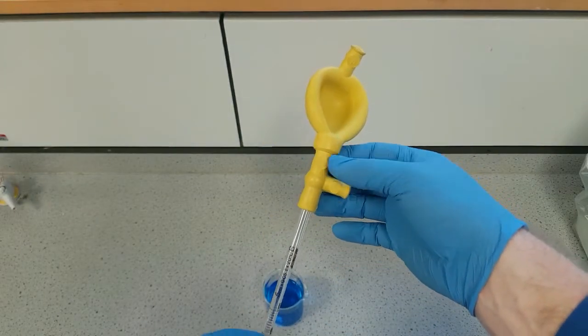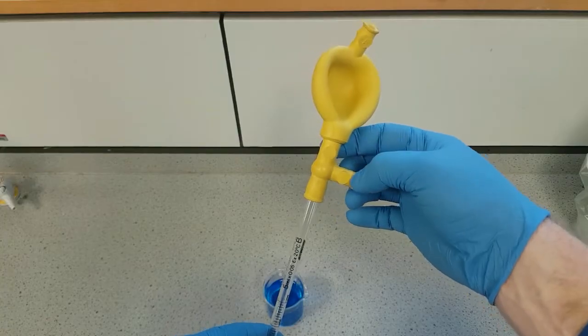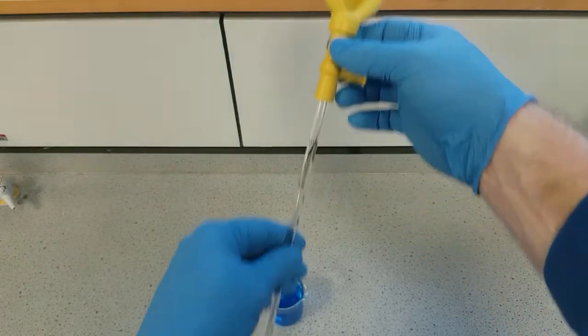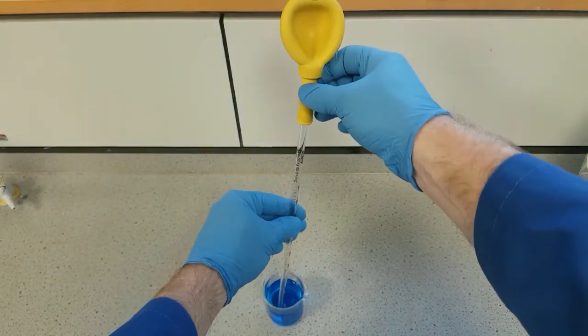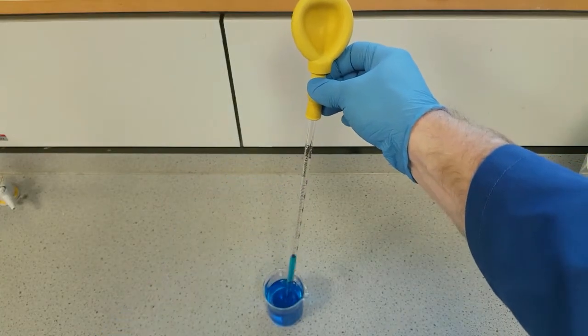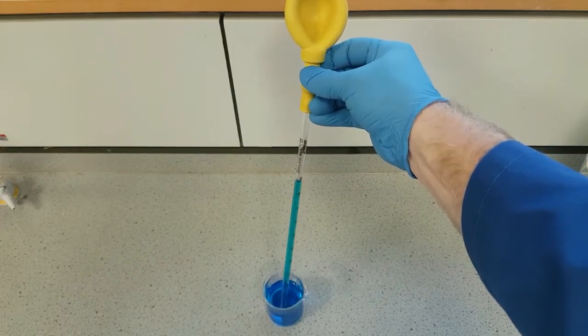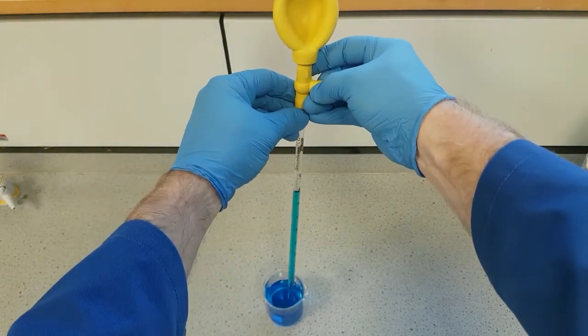Now we're ready to draw up liquid, so we'll press the S valve first and then to dispense we'll press the E valve. So that's S to draw up, E to expel. Let's have a look at that. S and then E, S and then E.